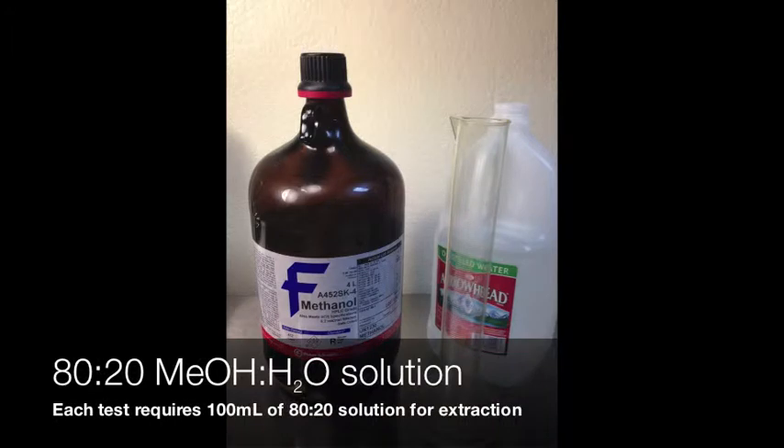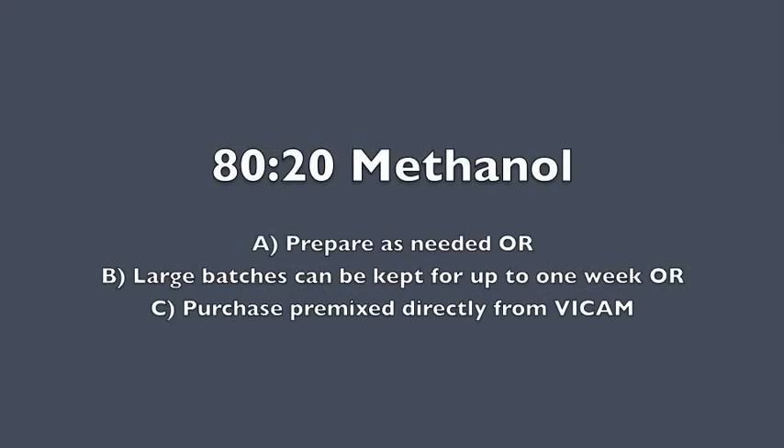Each test will use 100 milliliters of 80/20 methanol. You can either prepare this as needed, or you can buy a pre-mixed container direct from VICAM. If you mix your own, you can keep a large batch up to one week.